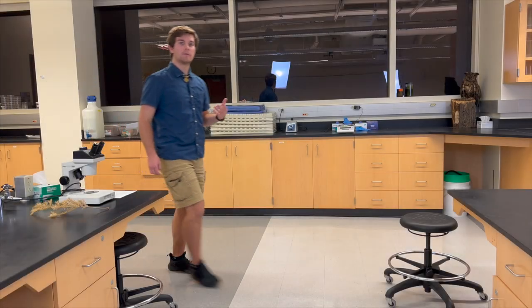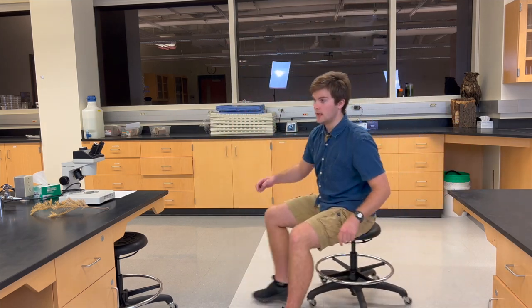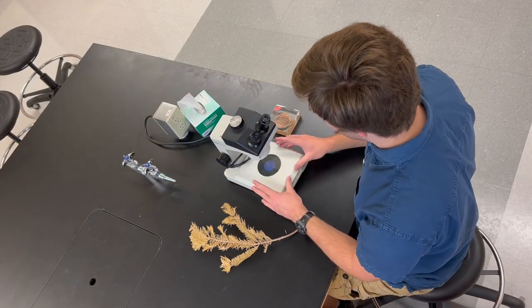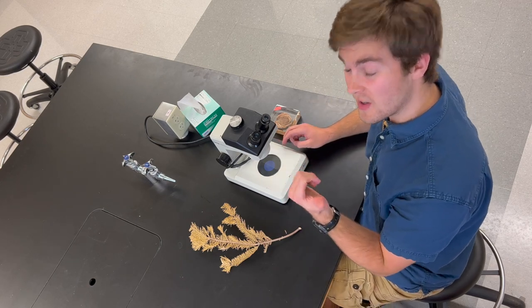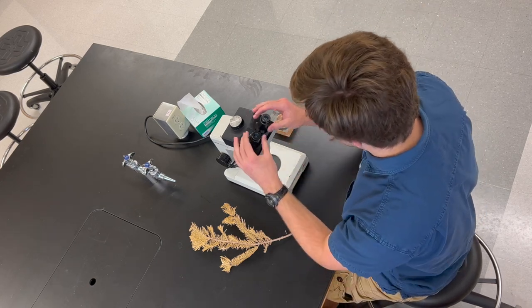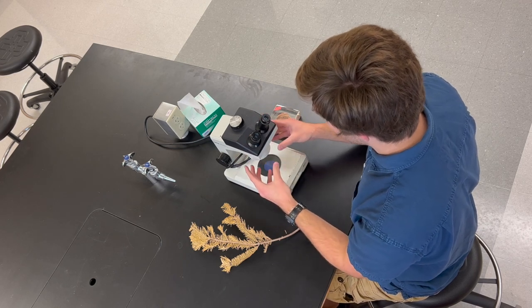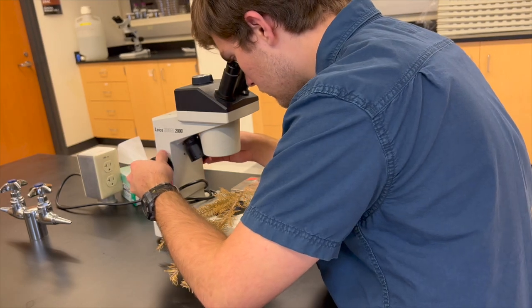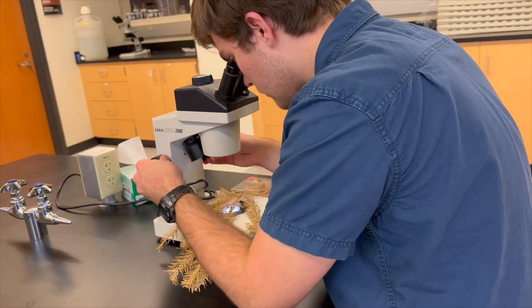Now that we've talked about the most important parts of our compound microscope, we're going to switch gears and focus on our dissecting scope. These scopes are quite versatile. They're designed to be looking at already dissected specimens underneath the scope because most of those don't fit underneath the compound microscope. They have one continuous zoom lens and an added feature of being able to move and manipulate your specimen so you can look at whatever structure you want. They can also locate tissue on specimens, which can then be used to create a wet mount and inspected further under a compound microscope.